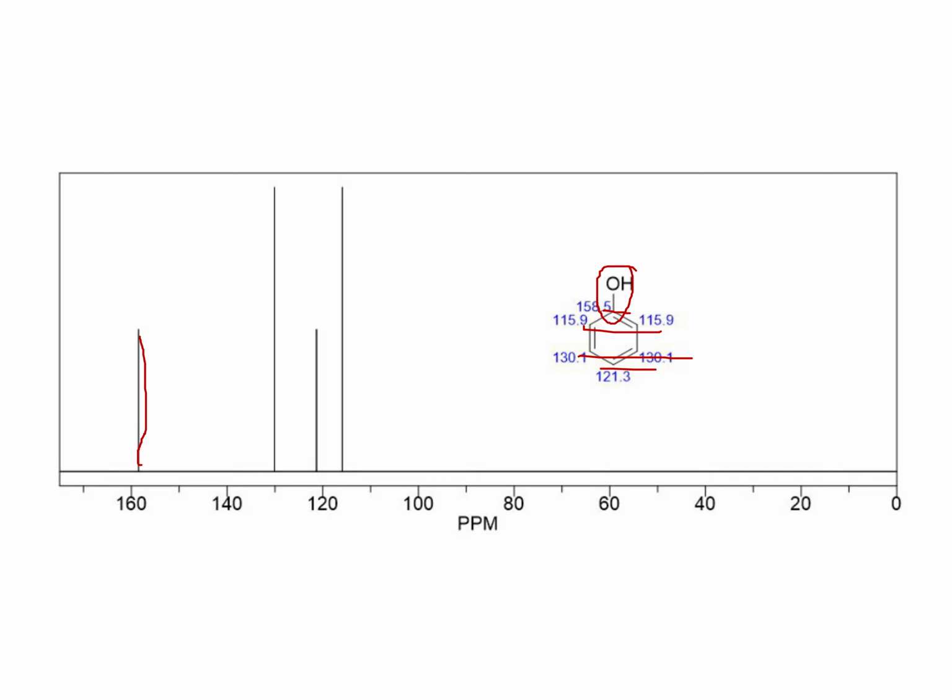So CO is here. Now it's time for the benzene ring. The overall ring is the benzene ring. The remaining three would be within the benzene ring, so the three would have three peaks. Their location, as the benzene ring, is around 150 to 100. So these three are for the benzene ring.